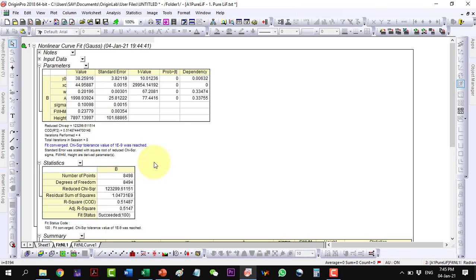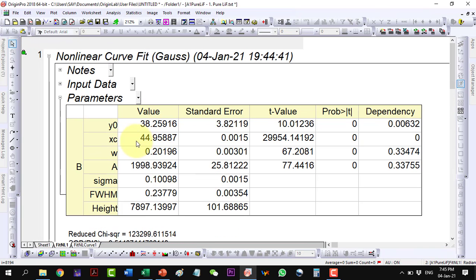Our xc value, the location of our peak, is 44.95887 and the full width at half maximum is 0.23779. We will need this value and this value for our calculations.